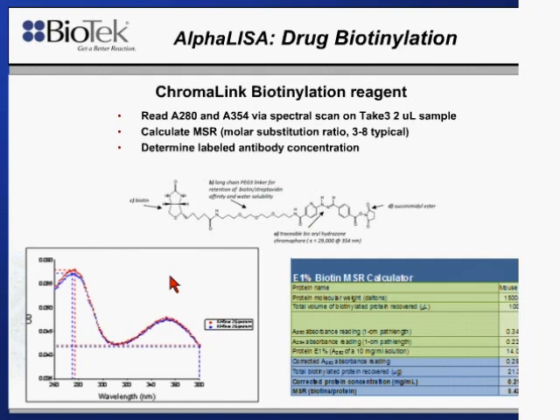And this was one of those cases where we essentially end up with 50 microliters of purified biotinylated reagent that we need to quantify, and we certainly don't want to put 50 microliters or all of the sample into a large vessel and then try to recover it and hope that we haven't contaminated it and so forth.